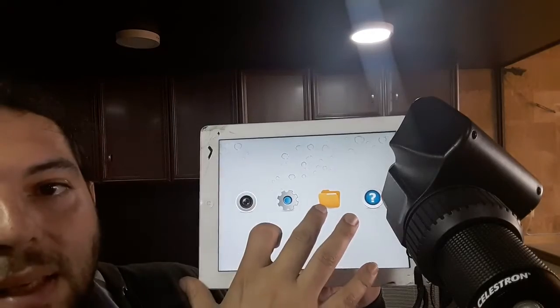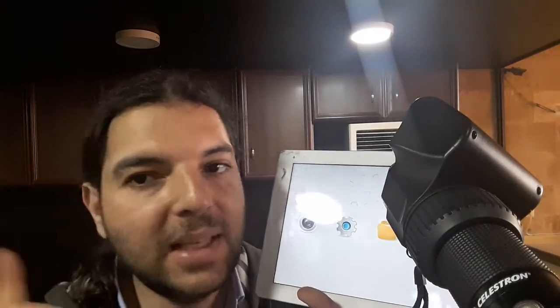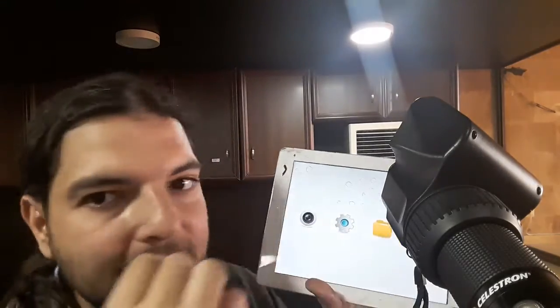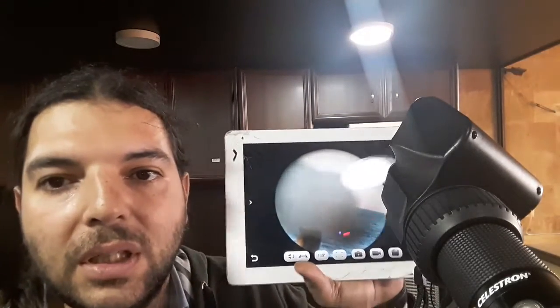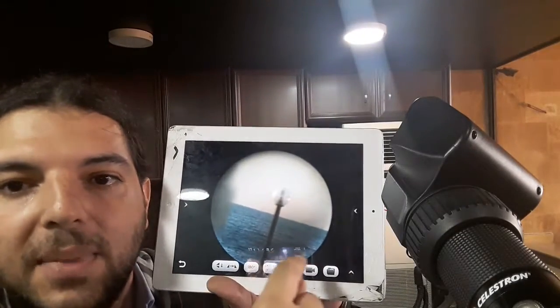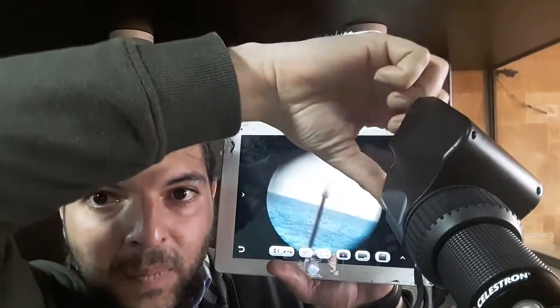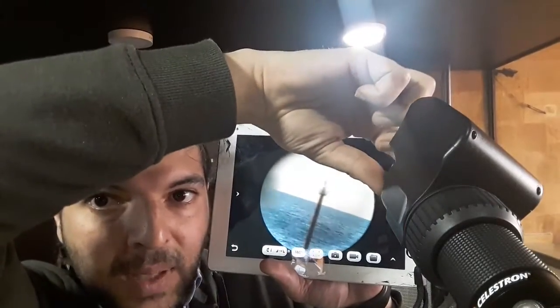Here you will find saved configurations. The same interface is found on Android, but it's easier to access files on Android. Going back, you can see what the telescope is viewing. You'll notice some black shades here because I rotated the knob in the back — that's why you have to fix the rotation.